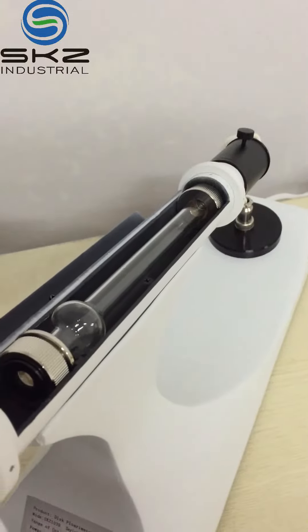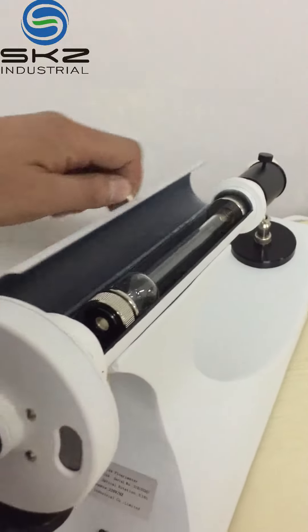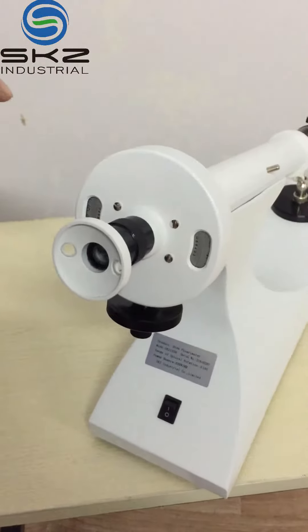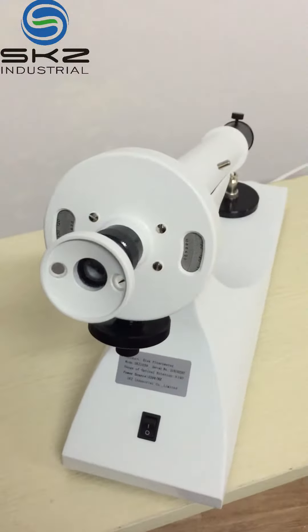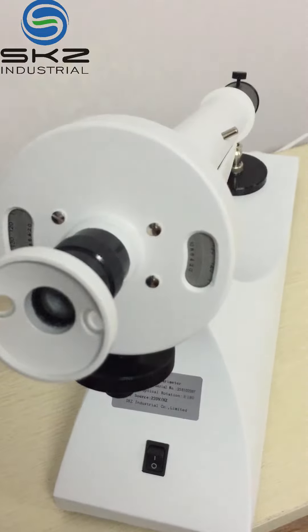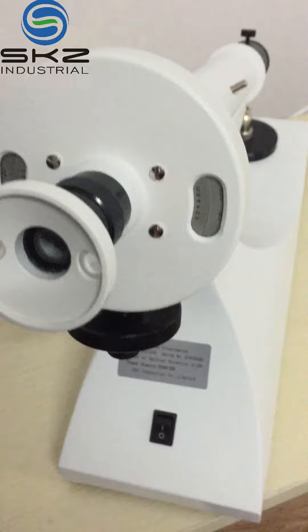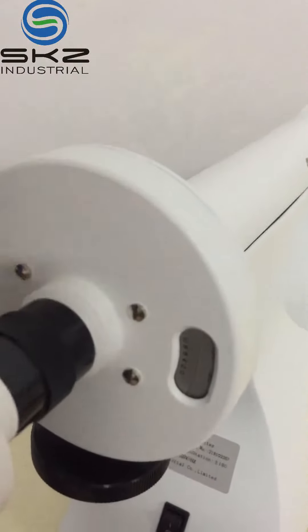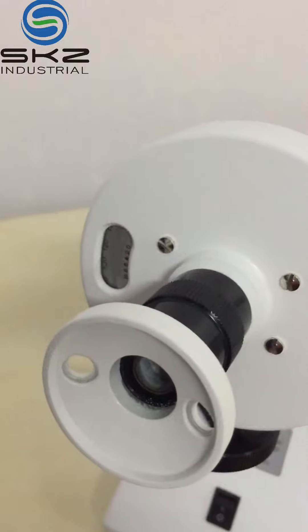SKZ1039 disk polarimeter. This part is a light source, collector lens, color filter. This is a test.